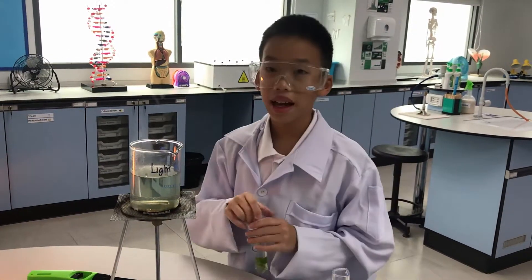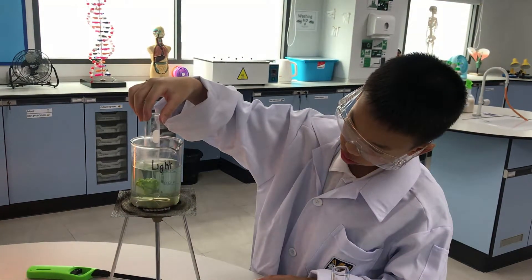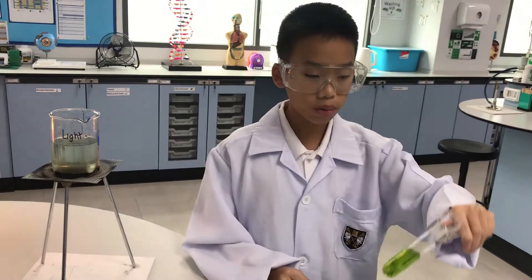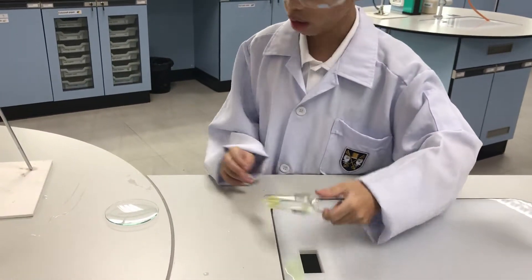We're now going to put the boiling tube into the water and leave it for two to three minutes. The chlorophyll is removed from the leaf — now pour the alcohol out of the boiling tube.